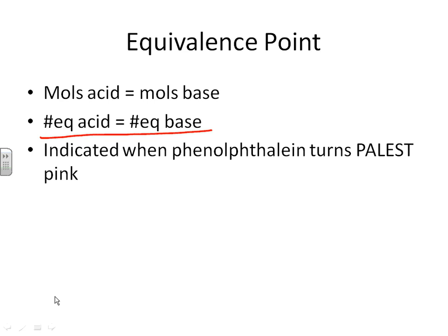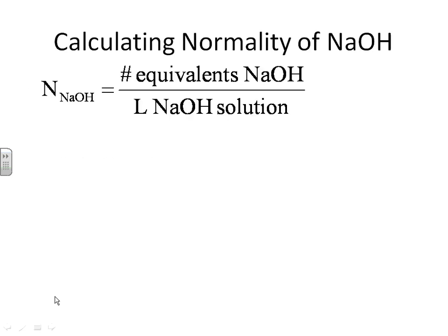I will then tell you to compare it to something that you know is colorless, like water, to put it next to it and to compare the two. And if you see a difference in color, even if it's slight, I'll tell you that it's pink and that you're good to go. We are not looking for hot pink. I will make you toss it out if you go into the hot pink zone for phenolphthalein.